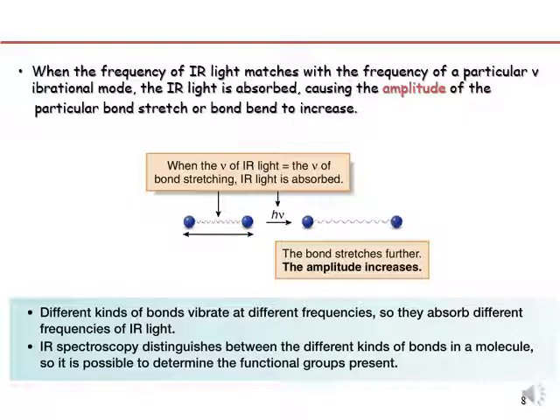When there is a vibration, we estimate that there is an amplitude in that motion. When the frequency is high, we know that the energy is also high.